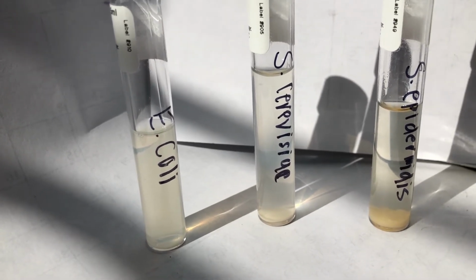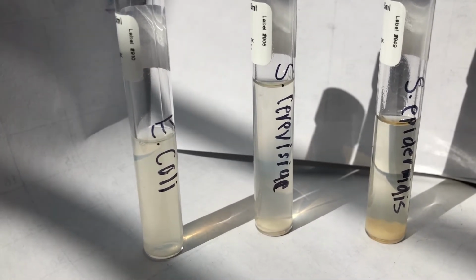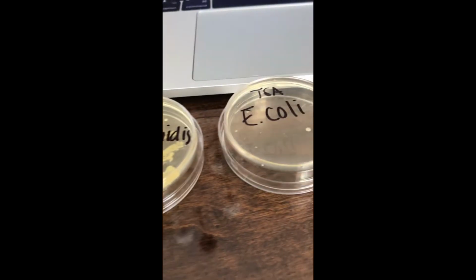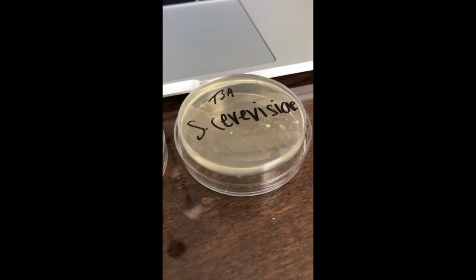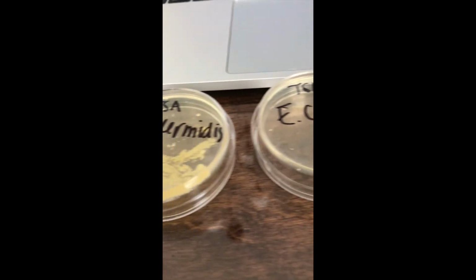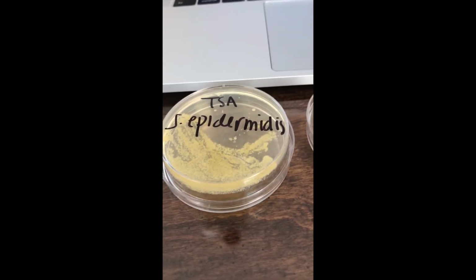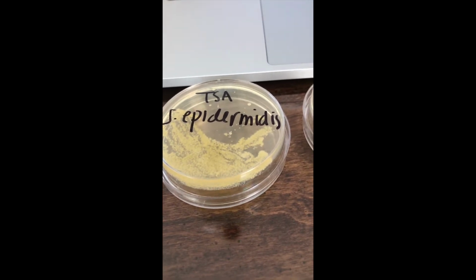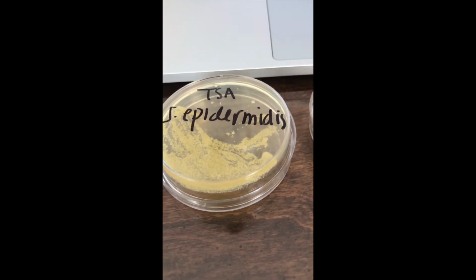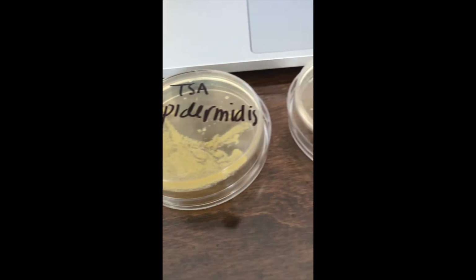And now all three of these samples will be used for part 2 of this experiment, isolating the individual colonies. This is the end result of the 3 samples as they were incubating for 48 hours. It seems as though the Staphylococcus epidermidis was the most successful in colonizing, as it had some pinpoint with very undulate and rhizoid shaped growth.